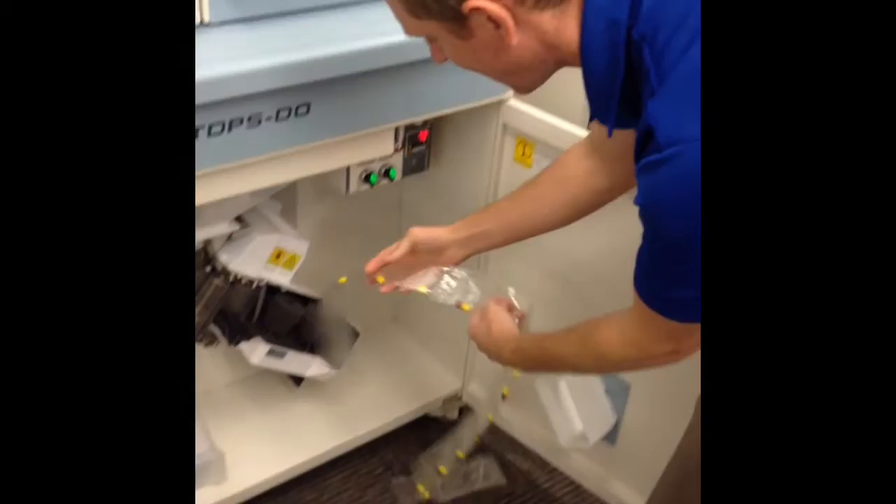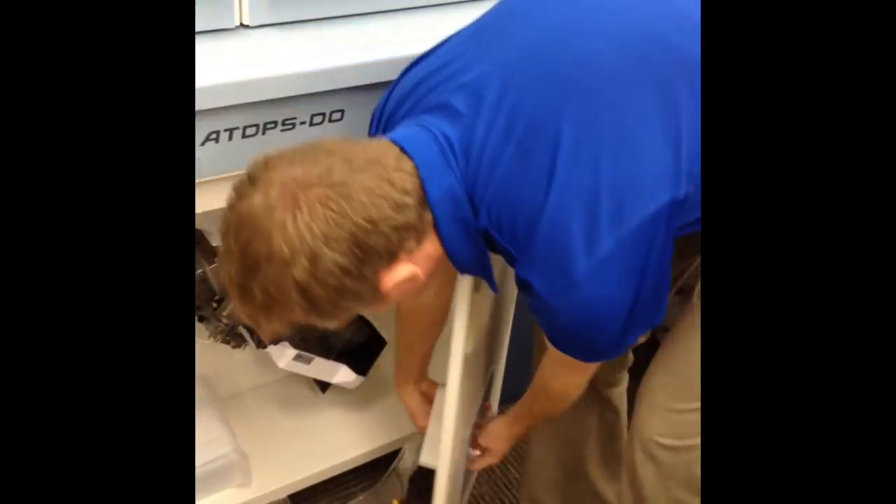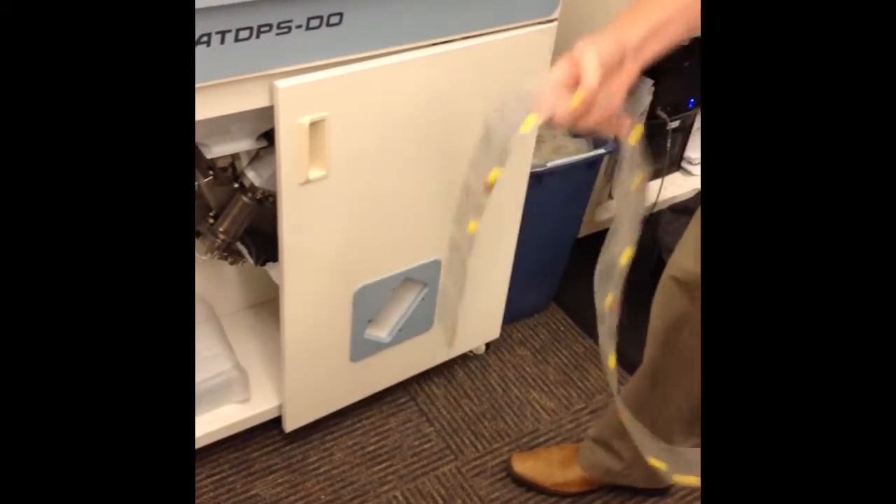As you can see, it cuts it out once it's done. When the machine is closed, it spits it out this little slot here. And there you can see our little Rex Packs right there.